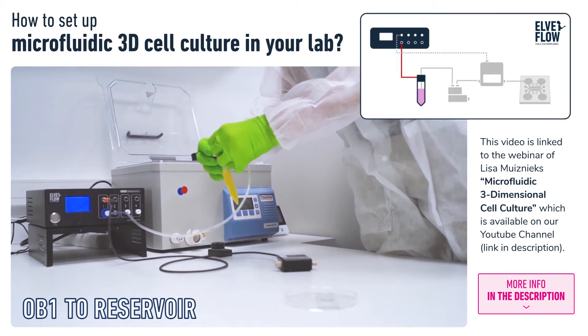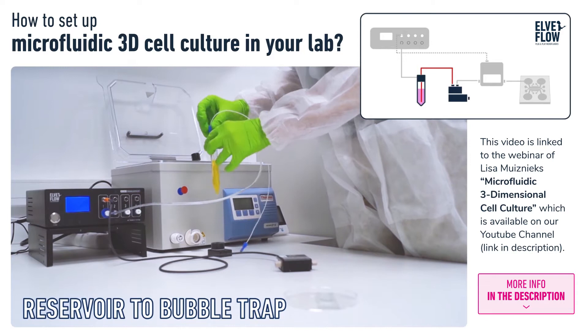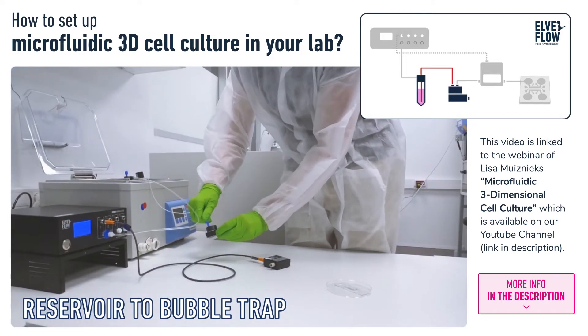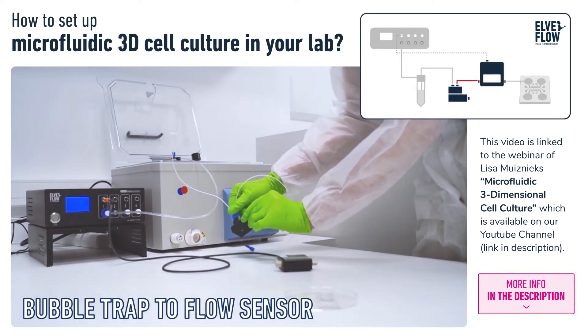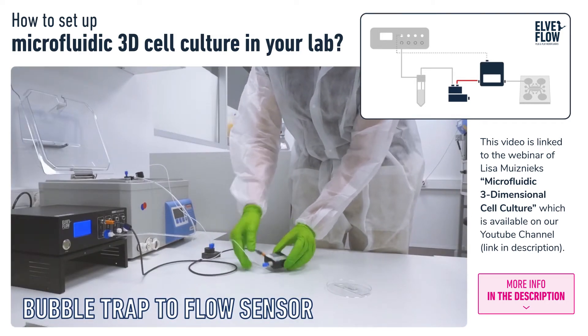First, we connect pneumatic tubing from the pressure-driven flow controller to a liquid reservoir. Then we connect the PTFE tubing for liquid from the reservoir to the bubble trap, which traps and removes any small air bubbles. Then we connect the bubble trap to the flow sensor, which measures and controls the flow rate via feedback cable.